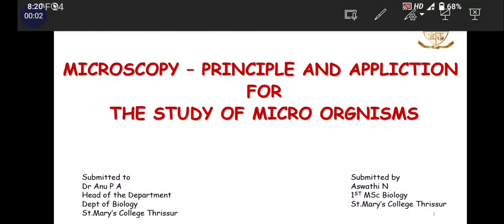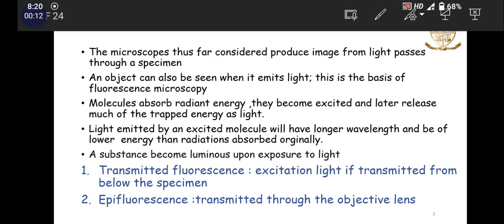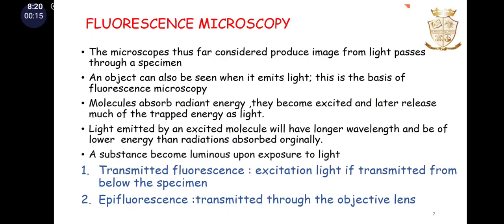Hello all, here I am going to take the seminar on the topic microscopy and its principle and application for the study of microorganism. First, fluorescent microscopy. The microscopes thus far considered produce images from light which passes through a specimen. An object can also be seen when it emits light. This is the basis of fluorescent microscopy.